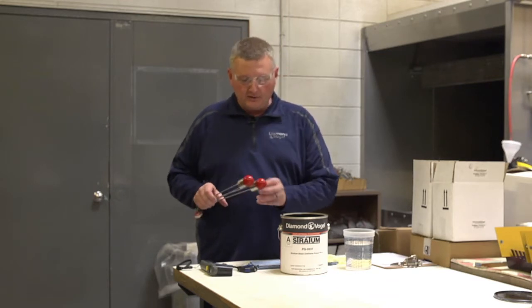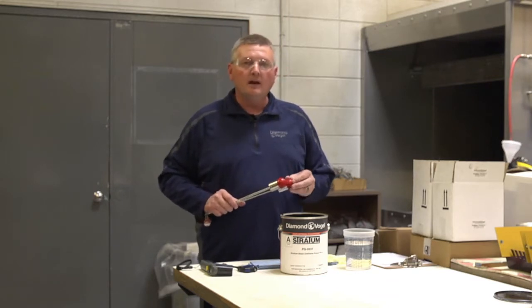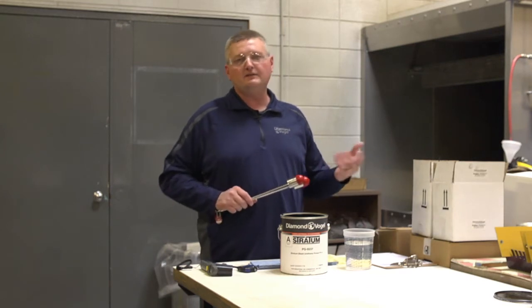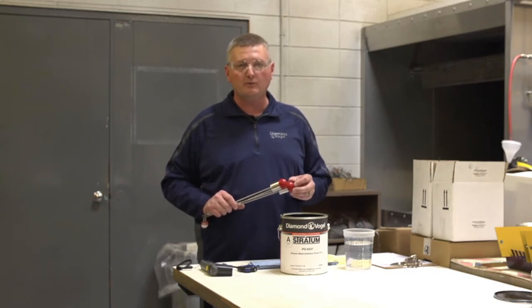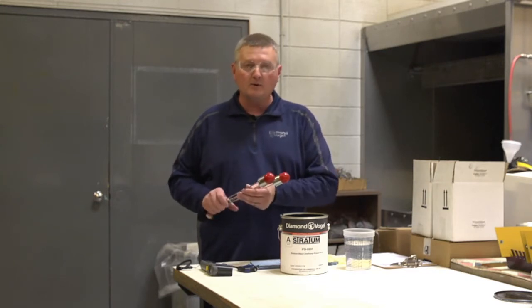So if you're reading something with the number two Zahn cup and it reads at 58 to 60 seconds, at that time you would probably want to go to a number three Zahn cup to get a little better reading on it.